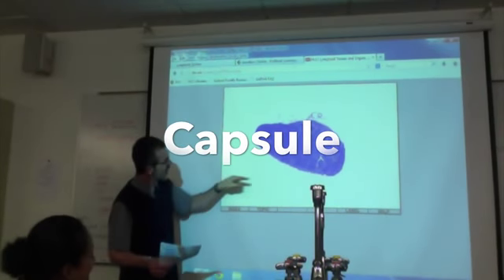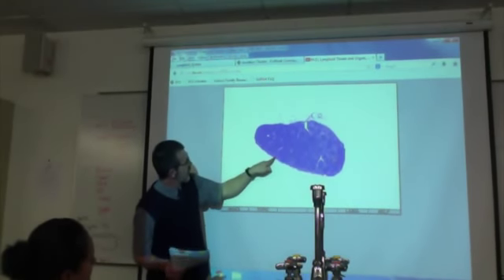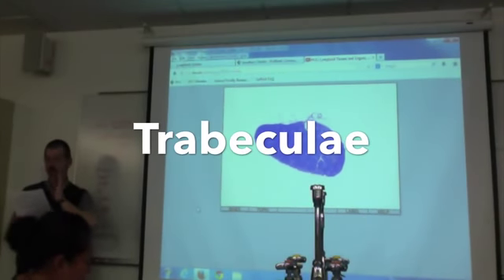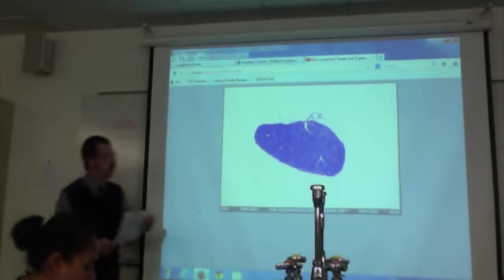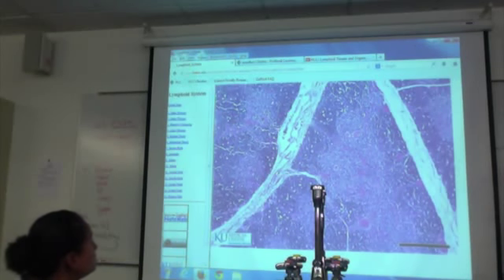And then you can vaguely see some little white lines that come from the outside toward the middle. What would you call those? Trabeculae. So you're going to use the same language, just remembering white versus red. It's the same answers over and over. So let's keep going. That's a spleen, interspersed circles. Now, what's different about this?